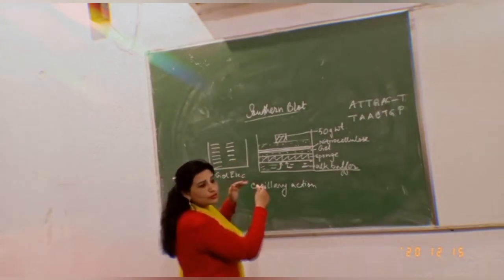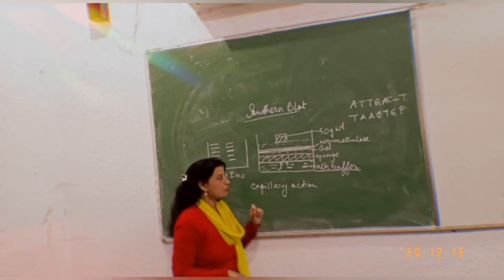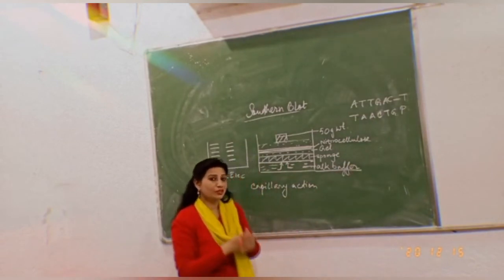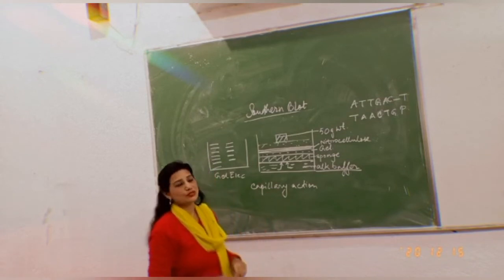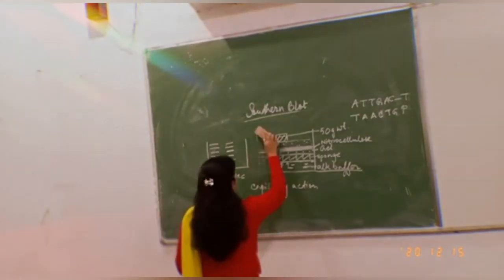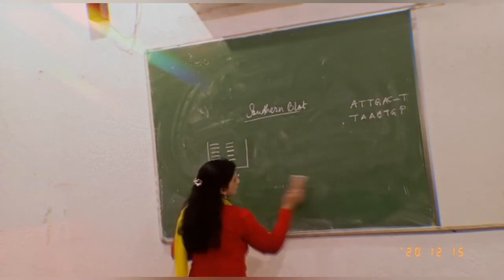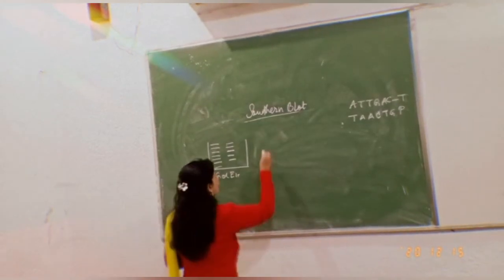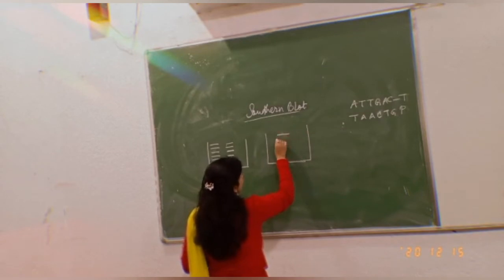Gel electrophoresis method gave me the total band, but at that time I was unable to understand whether my target sequence, or whatever is my target molecule, is present or not, and even if it is present, where exactly it is present. So now that I have got an exact copy, I can say that yes, my motive for this experiment through this multi-layered chamber is successful. Now I have got one exact copy, and I have got a band.